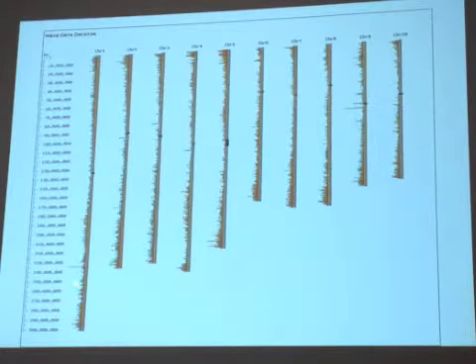One thing that puzzled me for a long time was this little thing that sticks out here. I found out finally, after a few years of staring at it, that it's a bit of mitochondrial DNA that got sucked into the nuclear DNA and then replicated itself. And there are some other interesting things up here. But typically you see the dense ends and narrower middles, but then there are some interesting peaks. So at this point, you can start looking at some patterns.